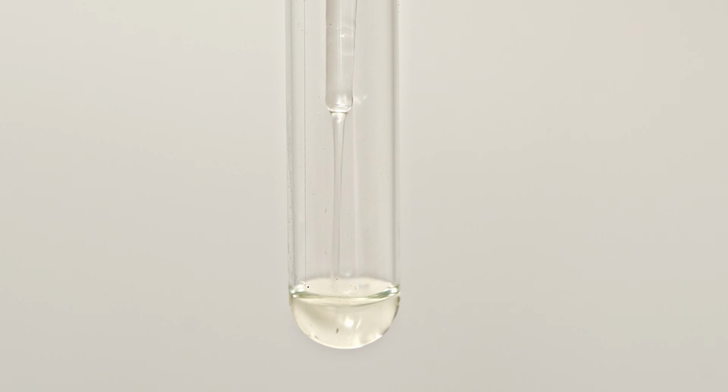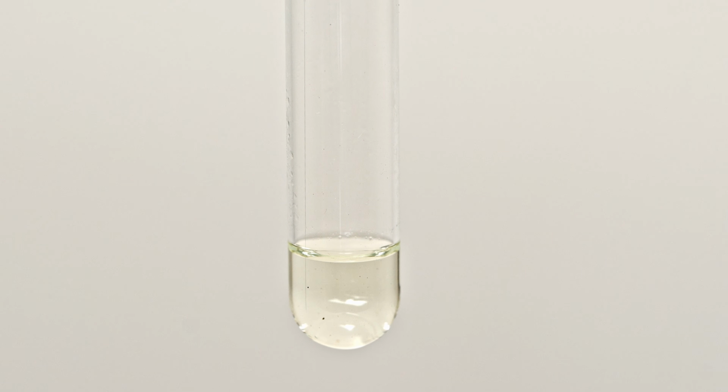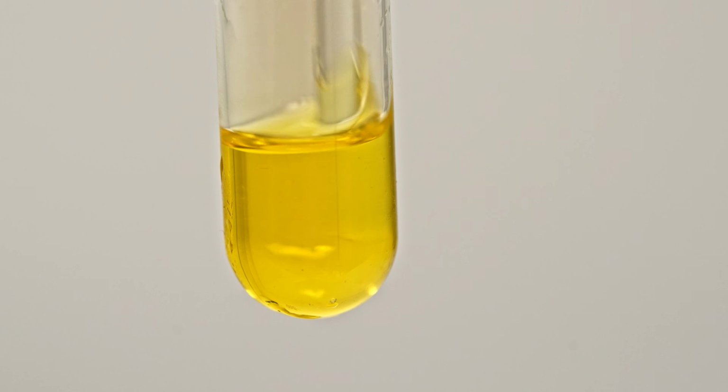Interestingly, dinitrogen pentoxide dissolves in anhydrous nitric acid and turns yellow. I've poured a small amount of this cold acid into a test tube, and now I'm adding some dinitrogen pentoxide. As more dinitrogen pentoxide dissolves into the nitric acid, the yellow color becomes more intense.